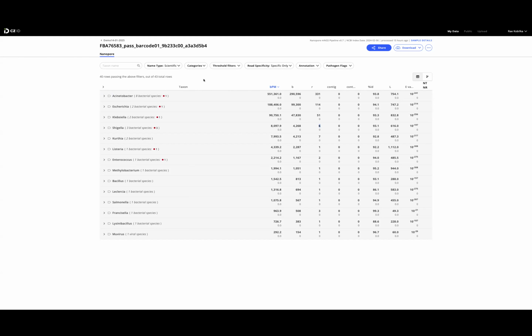I think that's a thing you should always keep in mind, that it's not a clear finding here. You always have to analyze it yourself, and you always have to keep in mind your clinical question behind that.